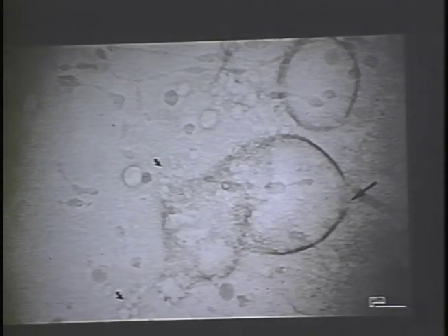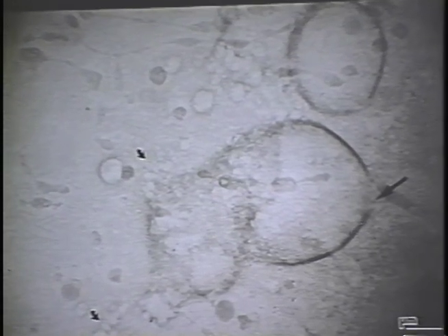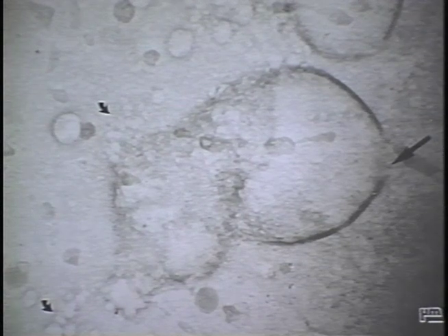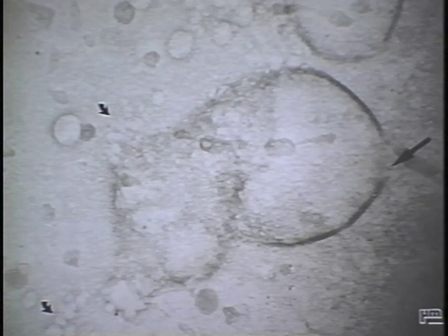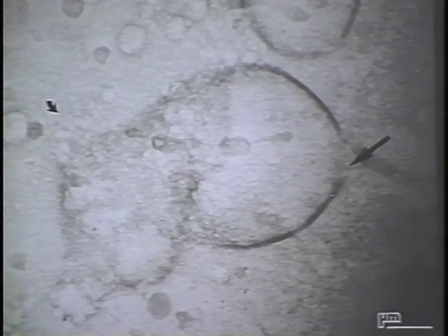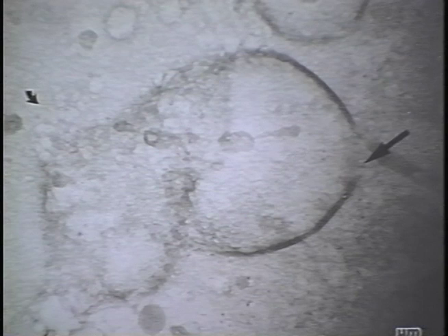This slide illustrates the importance of low-dose imaging and shows the dramatic effect of the electron beam on frozen samples. This is a low magnification of a frozen hydrated cell, which has been exposed in this area at a very high electron dose of over 1,000 electrons per square angstrom. We consider low doses to be 1 to 2 electrons per square angstrom per second.